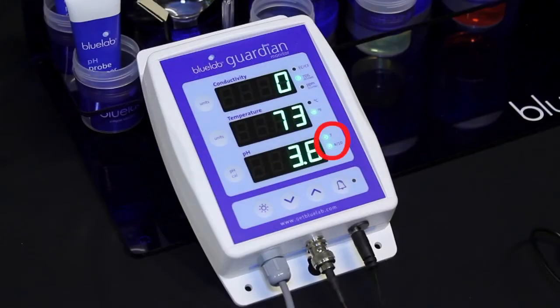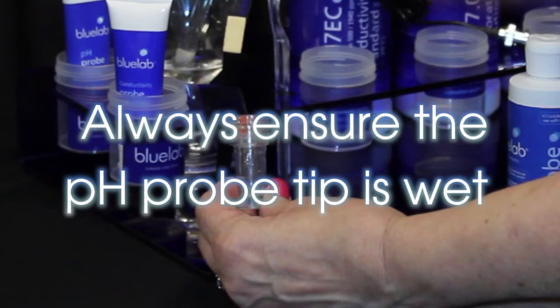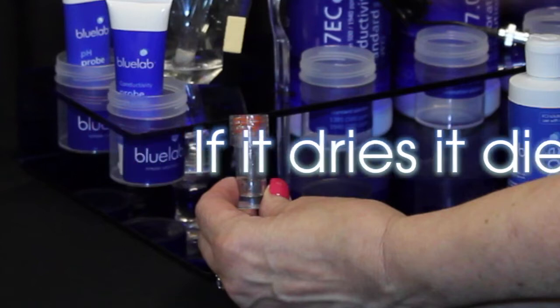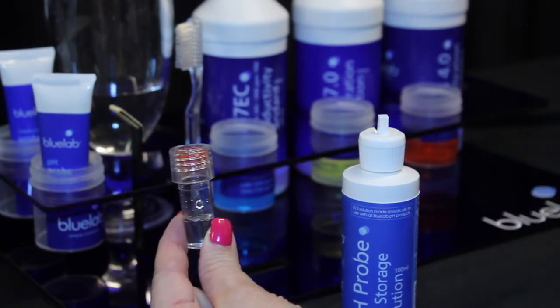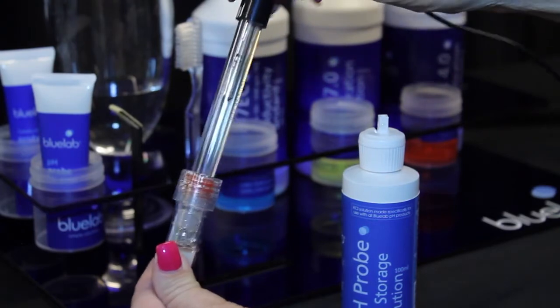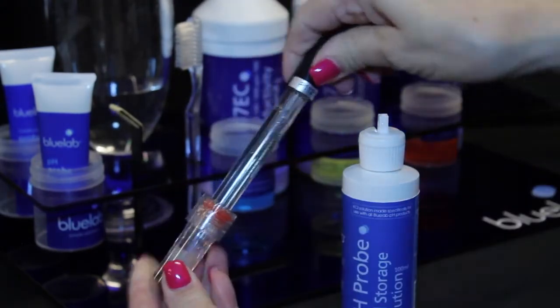To store the pH probe when not in use, always ensure the pH probe tip is wet. If it dries, it dies. Check that there is enough Bluelab pH probe KCL storage solution in the cap to cover the probe tip. If not, add KCL solution to ensure the probe tip will be covered. Place the cap back on the probe and twist the top counterclockwise to secure.